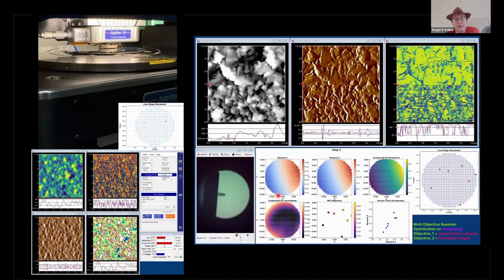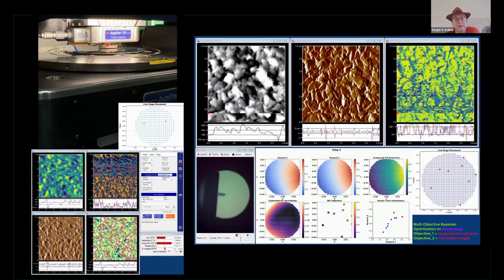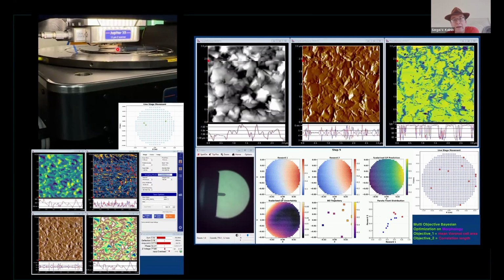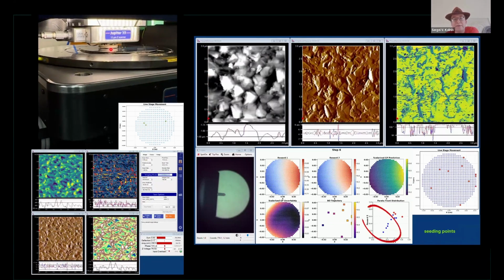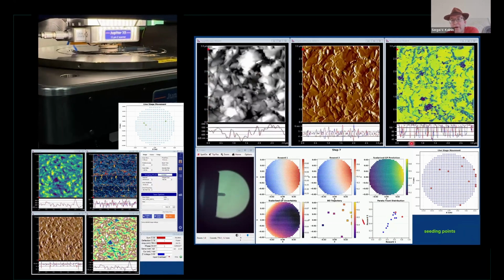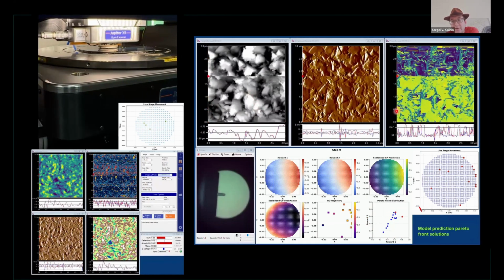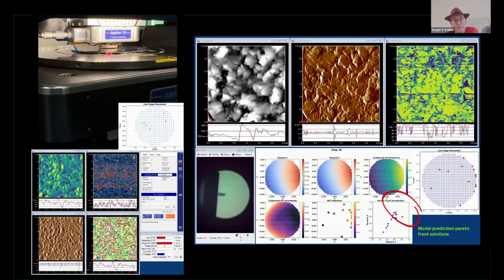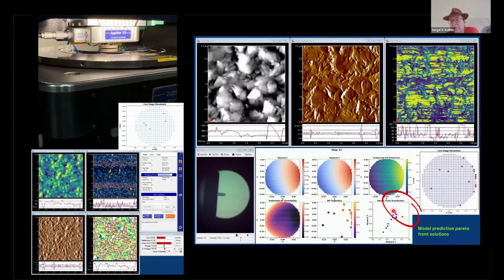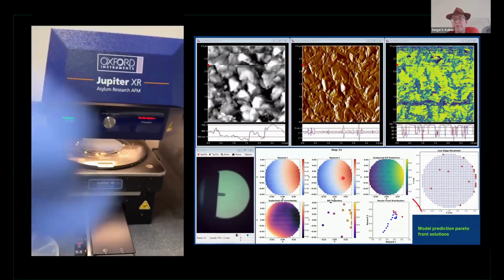So then, and this is the example how it works. So this is the automated microscope, which automatically explores the combinatorial library of the high entropy alloy based on the topography. And there is a machine learning algorithm that tells it where to take the next measurement. And this panel shows the front end. So this is the example of the topographic imaging. This is the library itself. So as you can imagine, these points correspond to this wafer under the microscope. And you can see how the automated experiment tries to discover the Pareto front between, for example, grain size and the surface roughness.